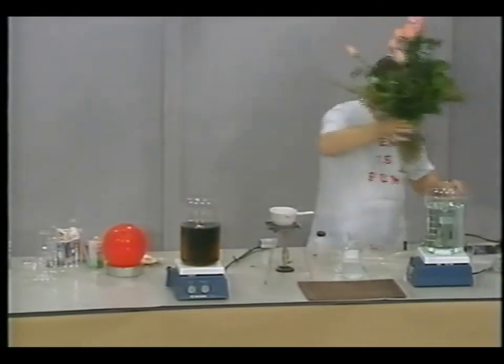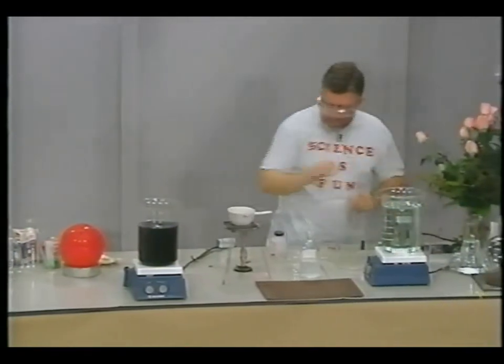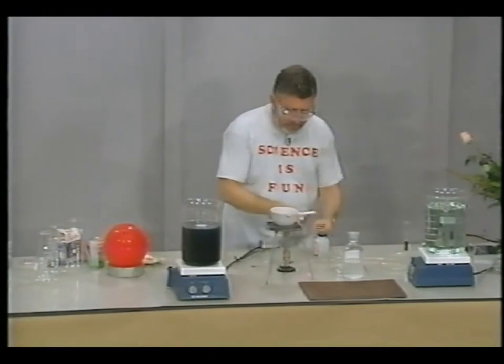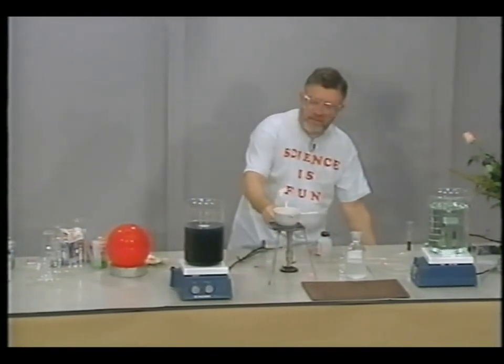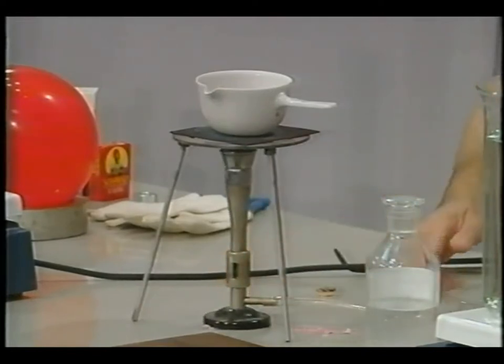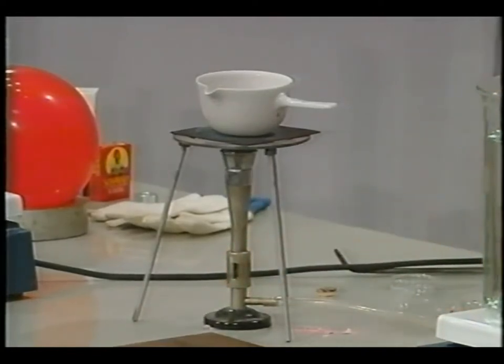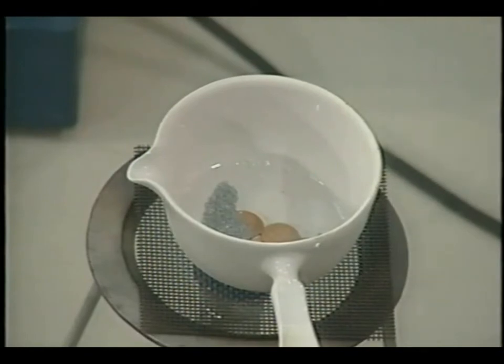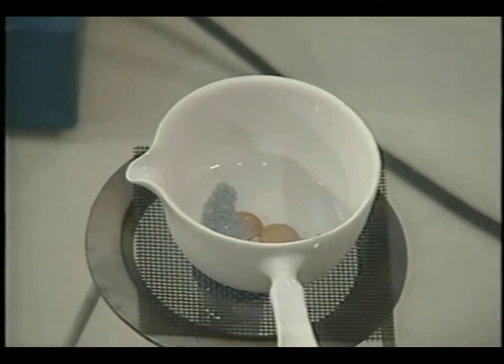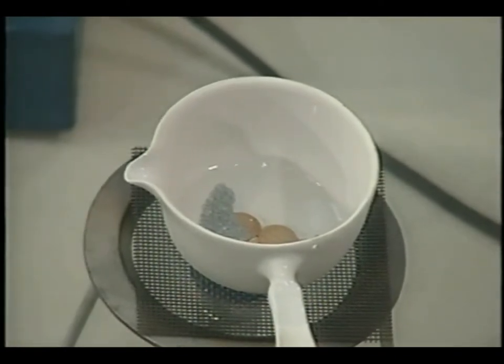So I take the beautiful roses out of the way and start the heating by turning the burner on, put this like so, and we'll see what kind of changes happen when we heat a solution of zinc chloride in contact with metallic zinc, also in contact with the copper penny. So this will take a while for it to go.